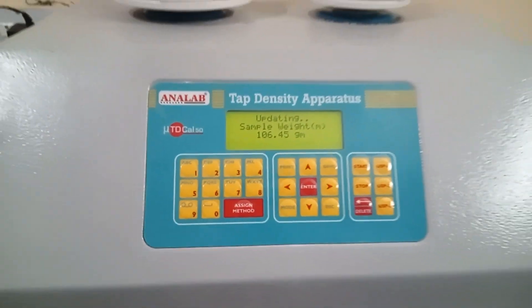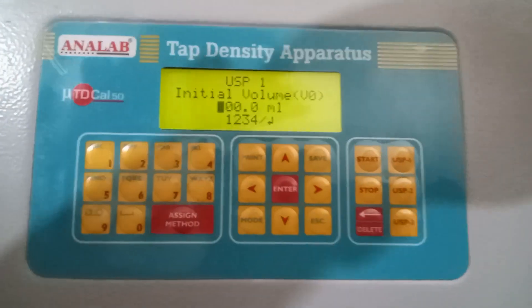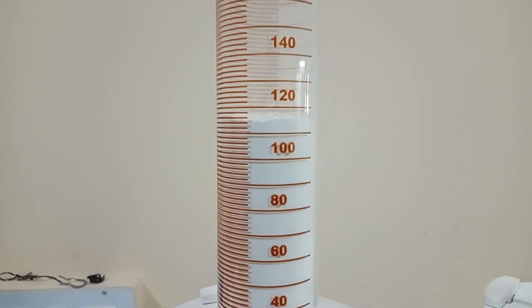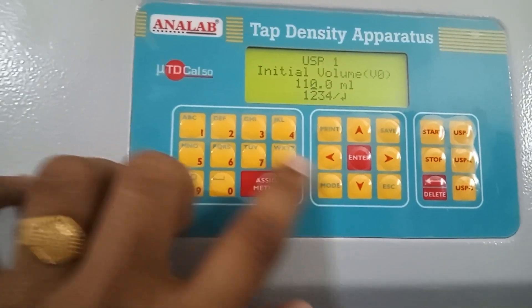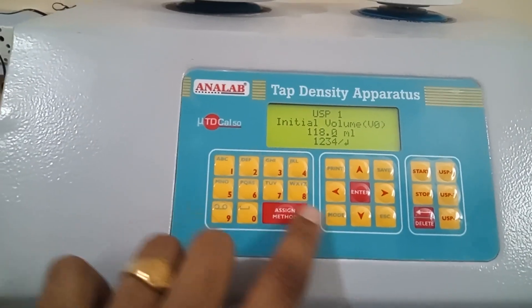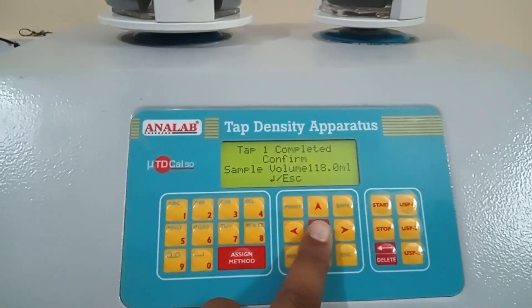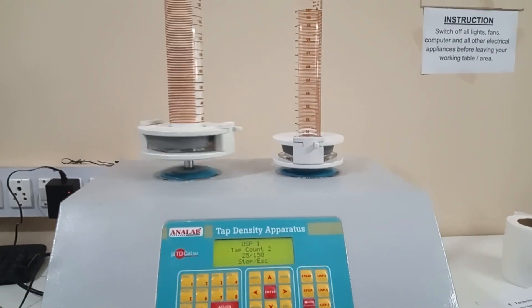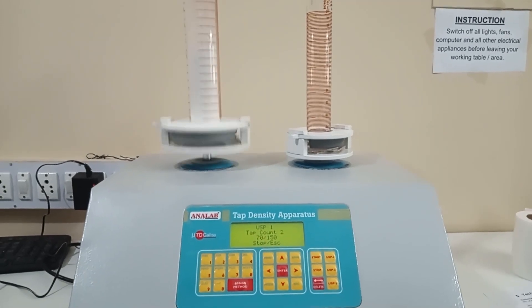Now we will press enter. These are basically the first 10 tabs for settling the sample. Now the instrument is asking to enter the initial volume. As you can see, the initial volume is 118 ml, so I will mention the same. Now we will enter the initial volume which is 118 ml. We will press enter. The instrument will ask you to confirm the initial weight, and we will start by pressing the enter key.